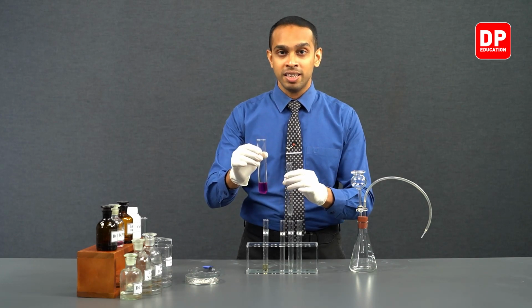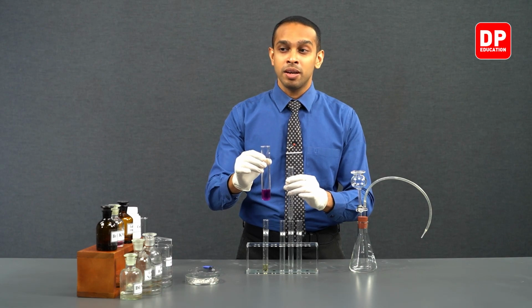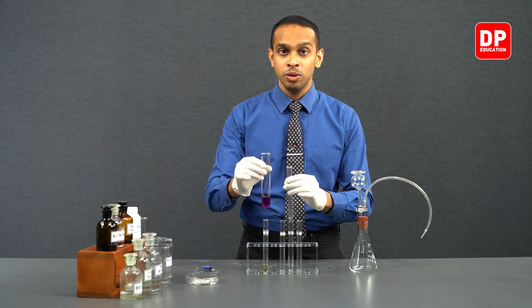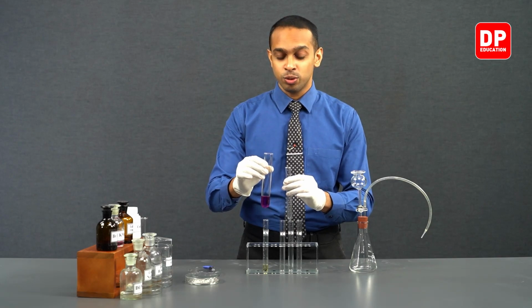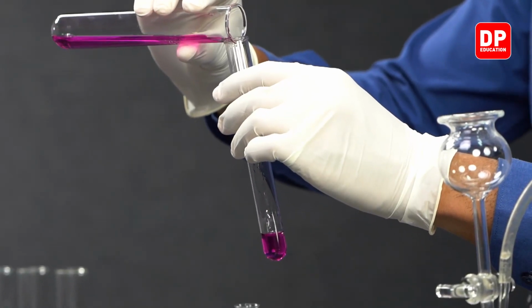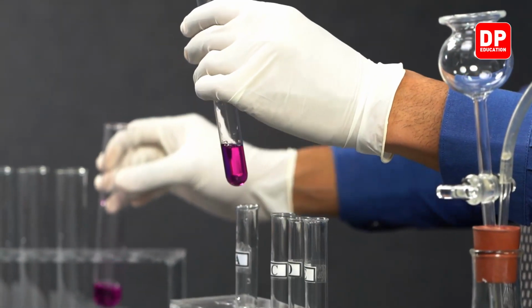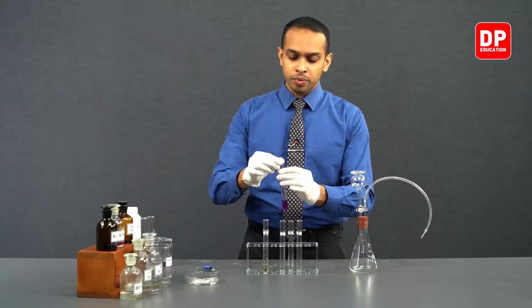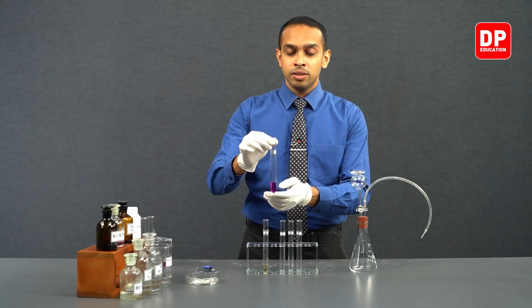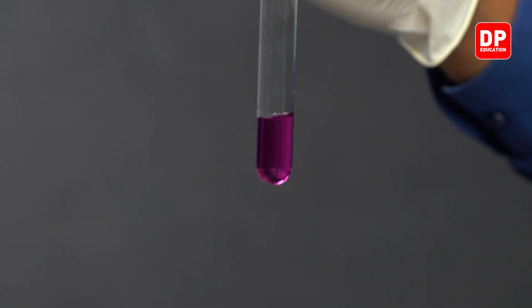So what we have here is alkaline potassium permanganate that we have made with the addition of sodium hydroxide to potassium permanganate solution. Now, in this test tube B, we have dilute alkaline potassium permanganate.